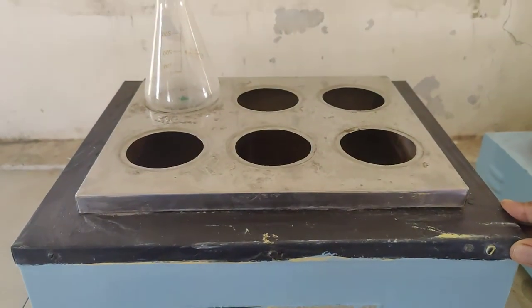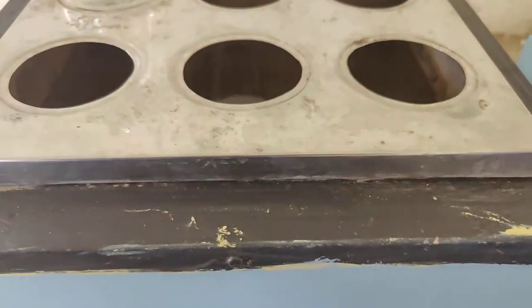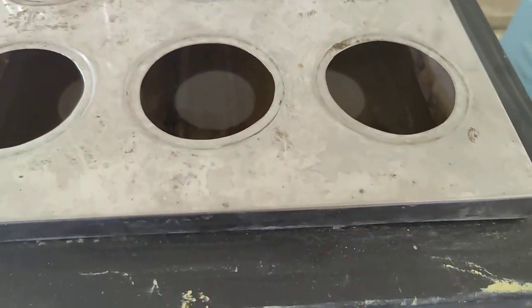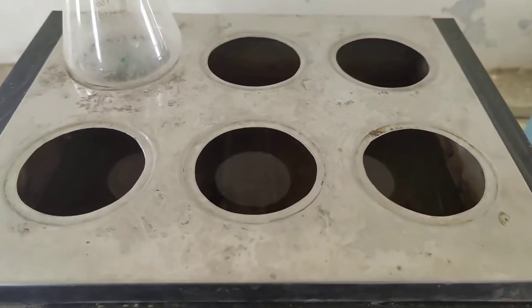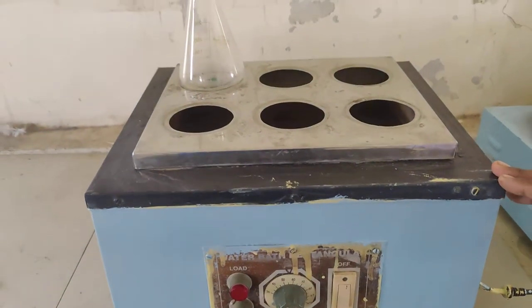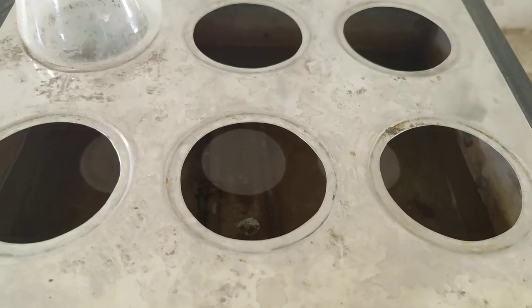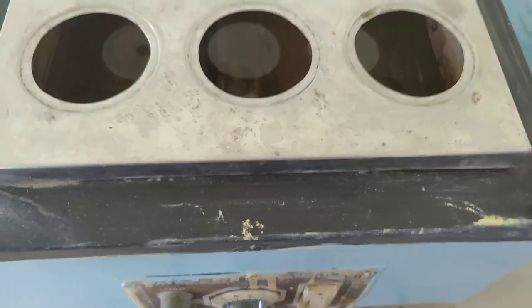Before operating this water bath rectangular, we have to check whether the heater coil is properly submerged in water or not. If not, we have to fill the water and make sure the coil is completely submerged into the water.